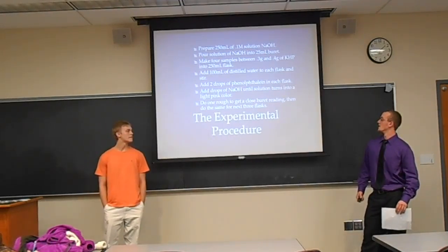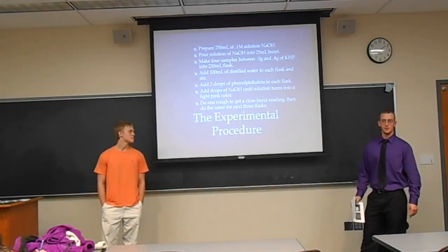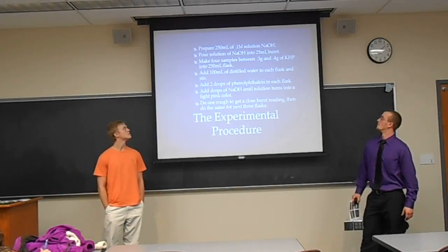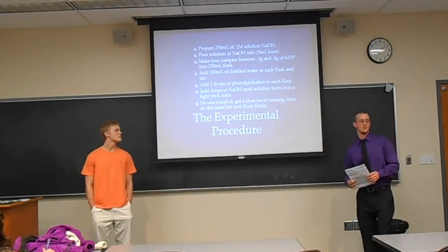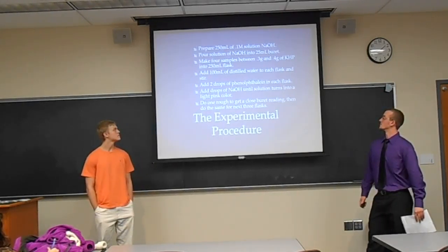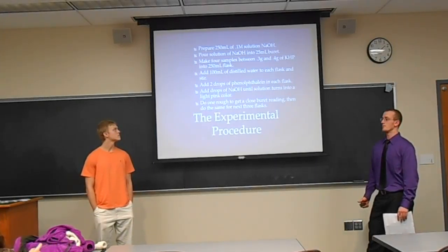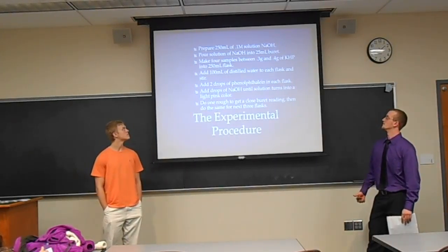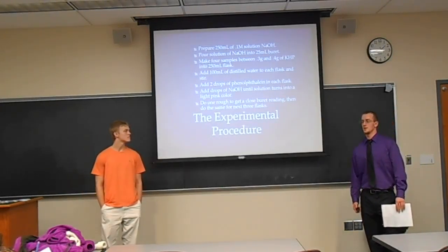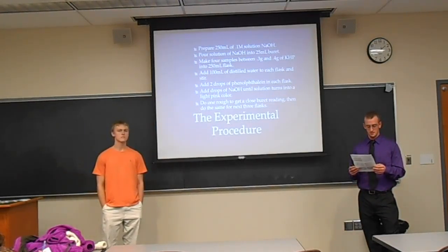Okay, so the experimental, we prepared NaOH, 250 milliliters. We put this NaOH into a burette that would be used for the titration process. 4 samples were made using a solid KHP between 0.3 and 0.4 grams. Those masses will end up making a difference in our results because just how much is in there will affect the overall concentration.